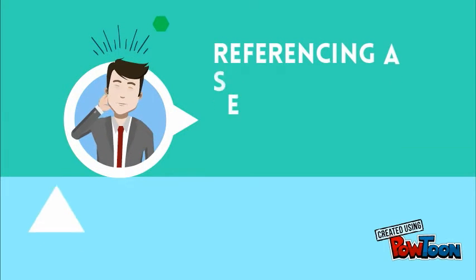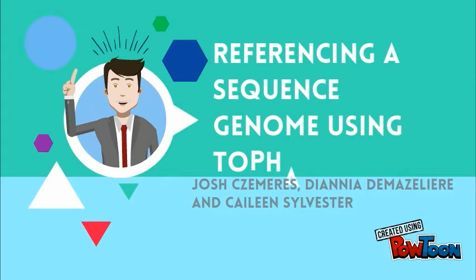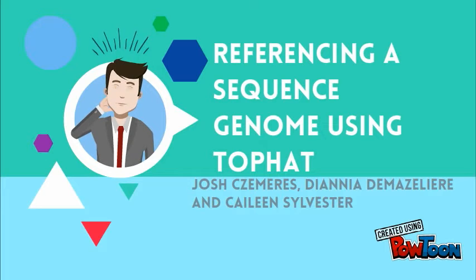Referencing a sequence genome using Tophat. By Josh, Diannia, and Caileen.